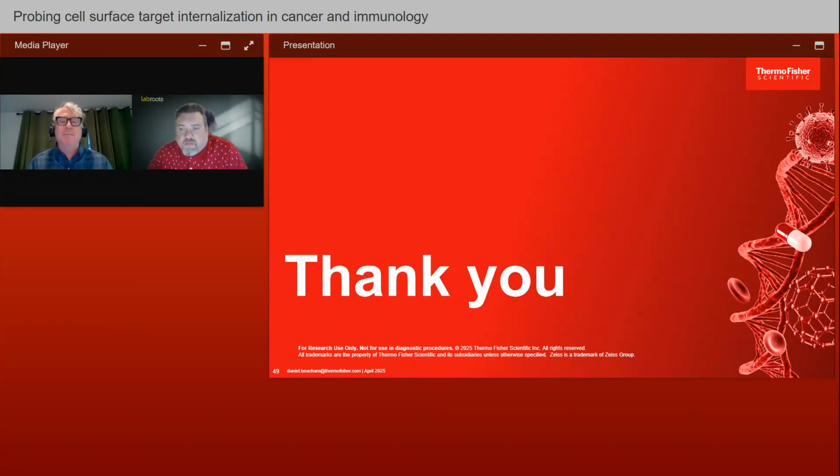It depends on your needs for the limitations, but as far as the workflows we've tried, it doesn't interfere with its neighboring dye channels at all. It's got a nice tight spectrum, and its limitation, I would say, is largely in the functional domain. It's a one-way signal that just shows the turn on, but there may be others I haven't thought of.